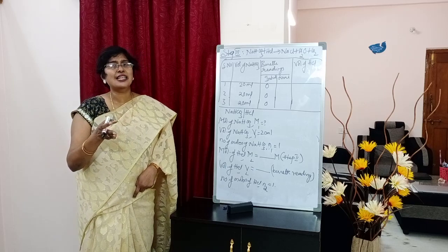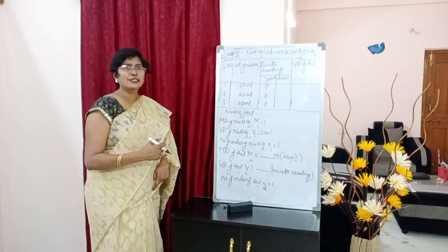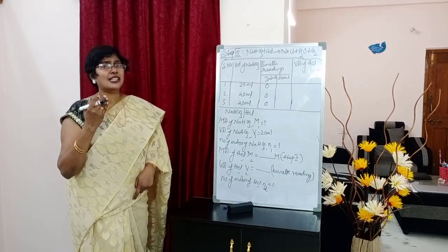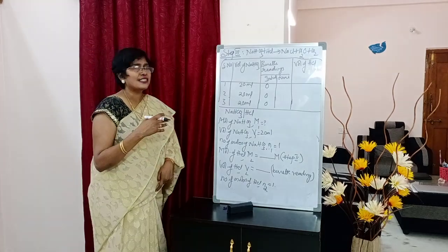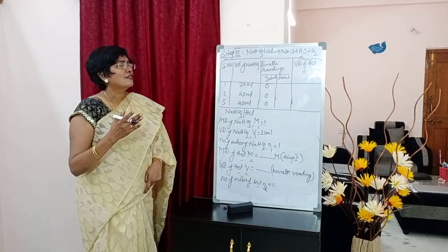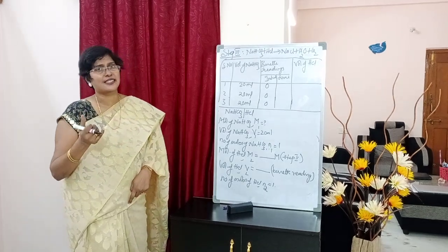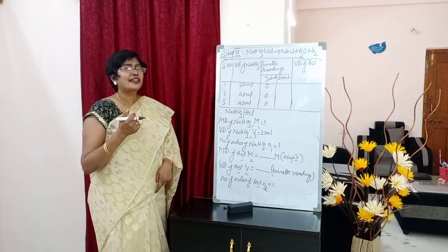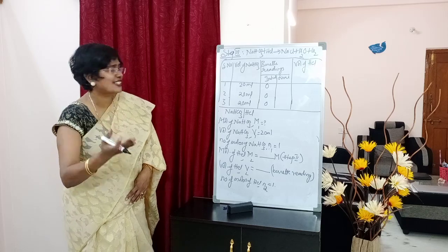Same like the previous one, but here it is NaHCO3. Serial numbers 1, 2, 3. Volume of NaHCO3, how much we have taken, students, unknown? 20 ml. So, 20, 20 and 20. Burette readings, initial 0. So, depends upon the final reading, that will be the volume of HCl. Fine. Next, below write down NaHCO3 versus HCl. Reaction taking place between sodium bicarbonate and HCl.